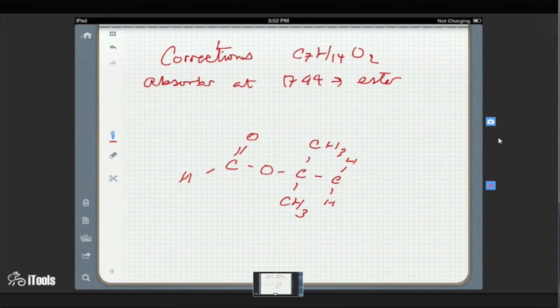Okay, yeah, all right. So these 2H, this one is the one that's... Wait. Maybe. CH2 is the one that's right here. No, but then you would have 2 methyl groups. Then you have 3 methyl groups in the same environment.